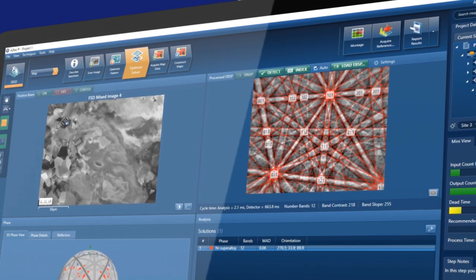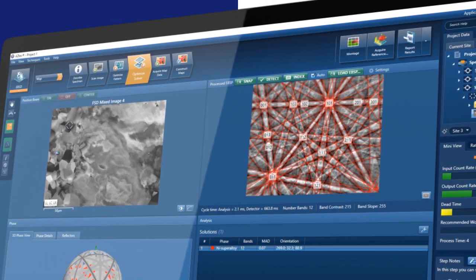Unlike other EBSD detectors, Symmetry S3 won't limit your applications.